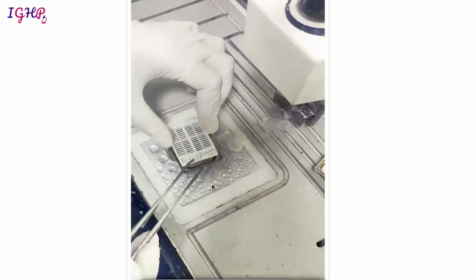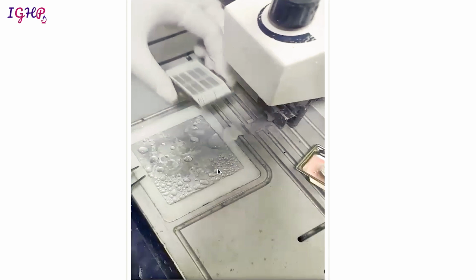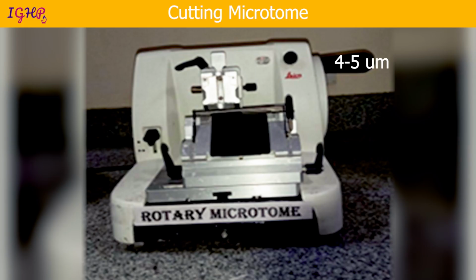So it is pressed a little, and then you put the cassette over it, and after some pouring of the wax, it is kept on the freezing chamber, that is the cold plate. On the cold plate, this will get fixed, so you can easily take out the block and use it for microtome cutting.